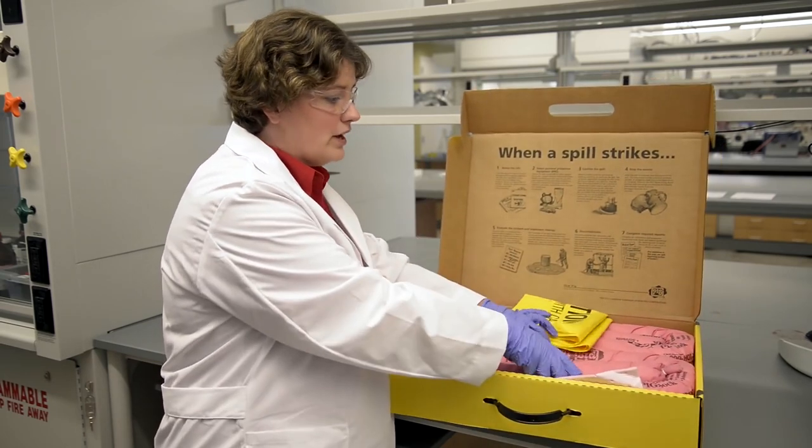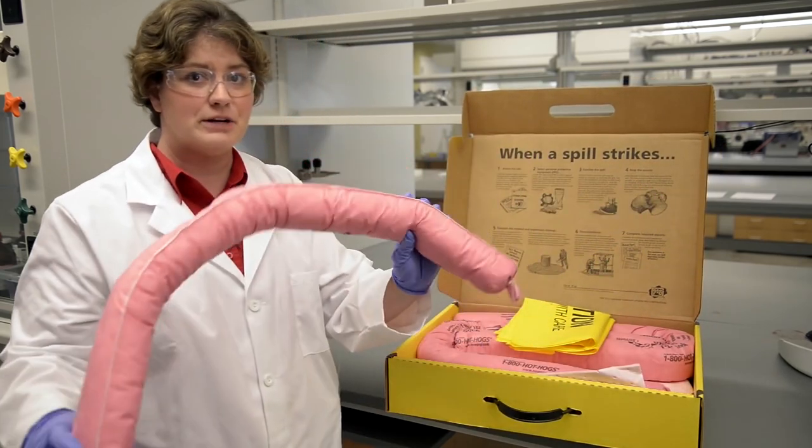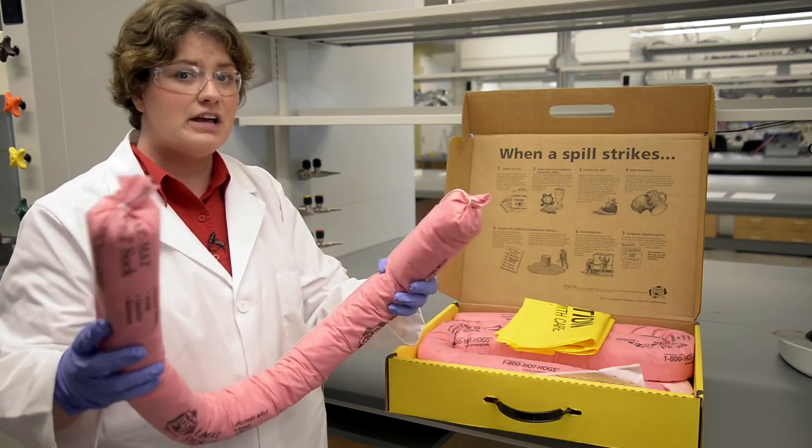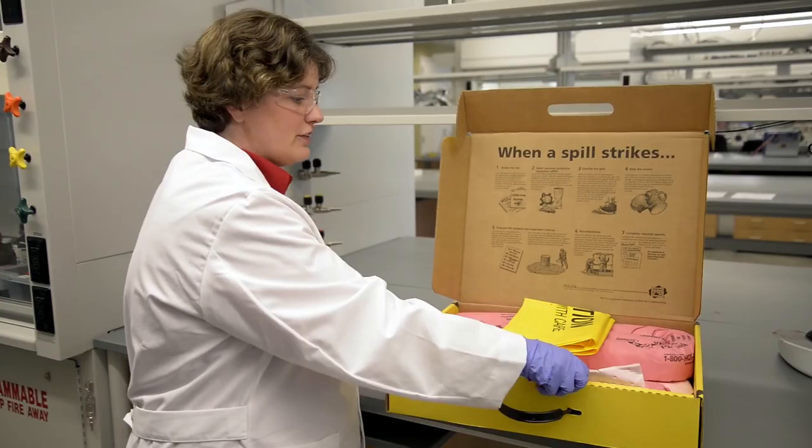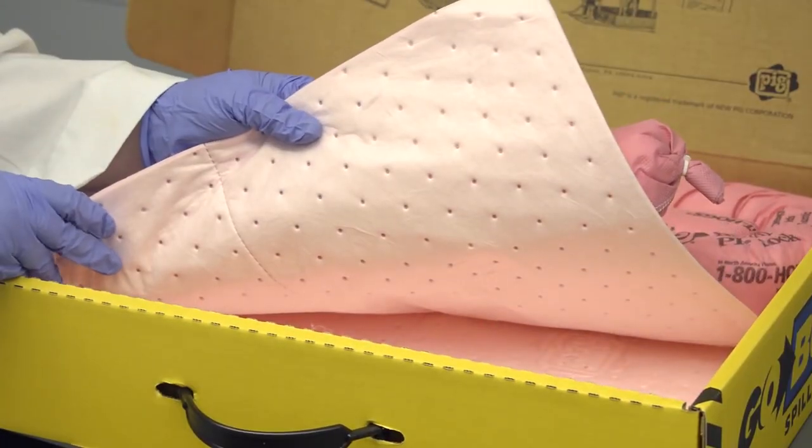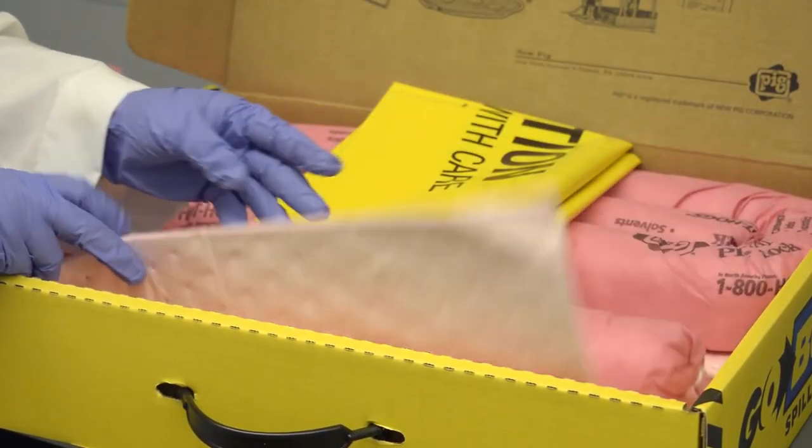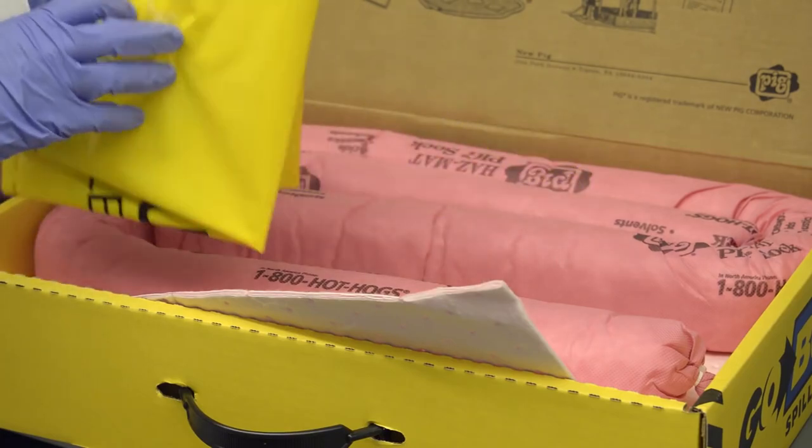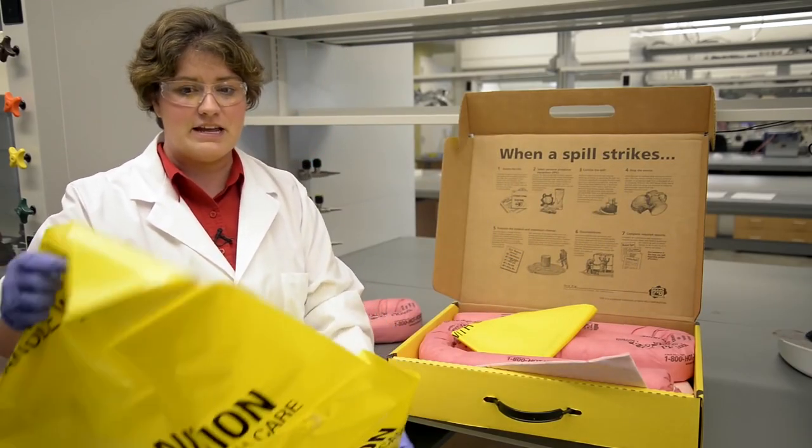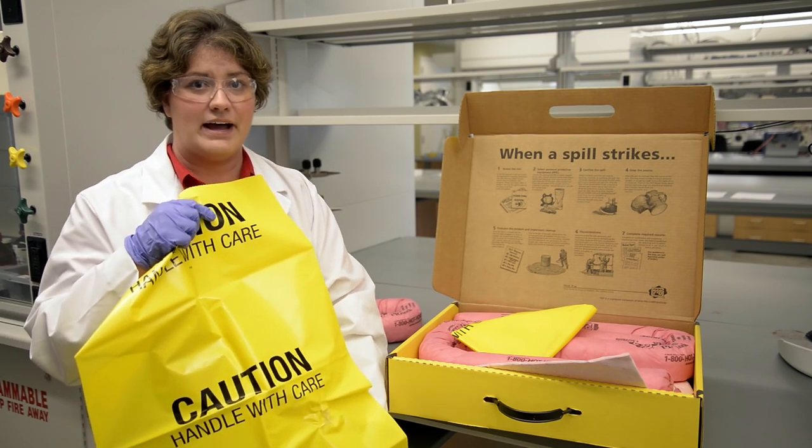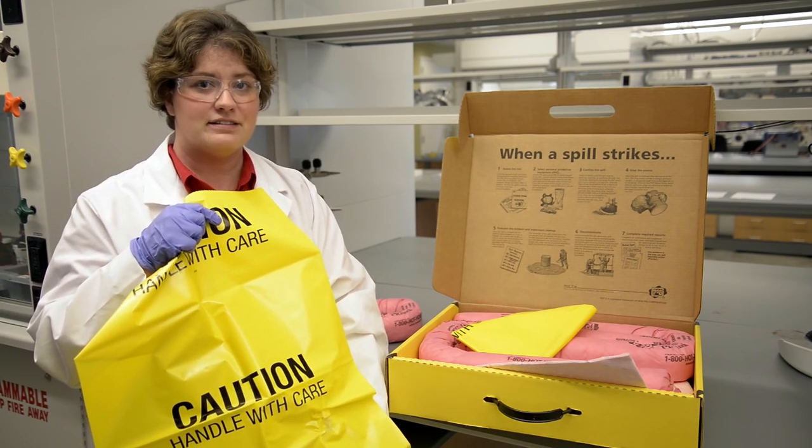When cleaning up a spill, you want to first create a barrier around the spill with an absorbent material. You can also use kitty litter. You want to then cover over the spill with more absorbent material to soak up the spill. Be sure to wipe up all of the spilled material and dispose of the spilled material and any contaminated PPE into a solid hazard waste bag and then call environmental health and safety for pickup.